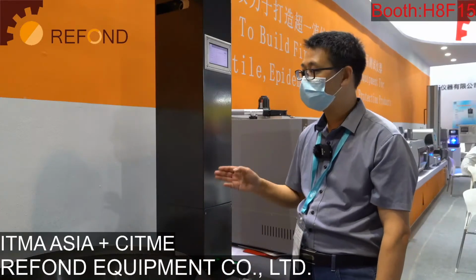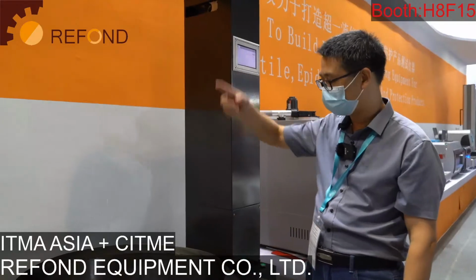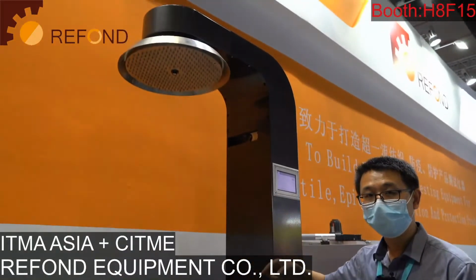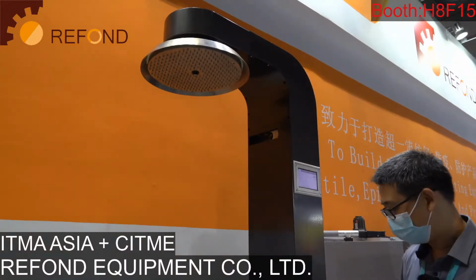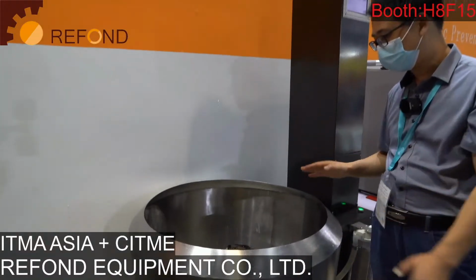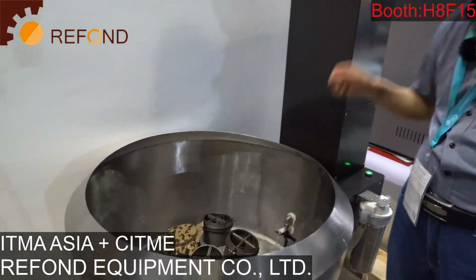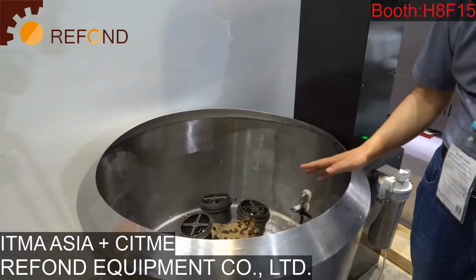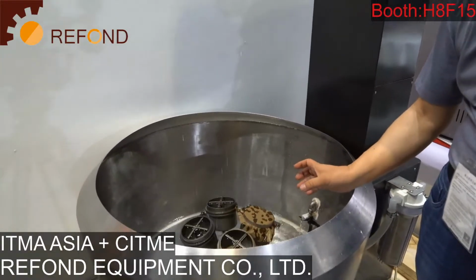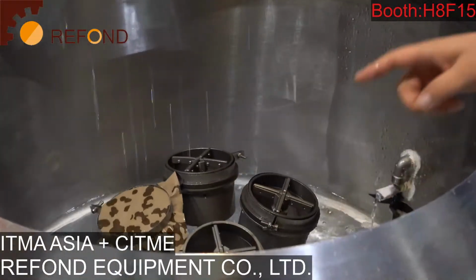Let me introduce one more of our machines. This is the Bundesmann water repellent tester. This machine simulates raindrops falling from 1.5 meters high. The water is dropped on the top surface of the specimen, right here.